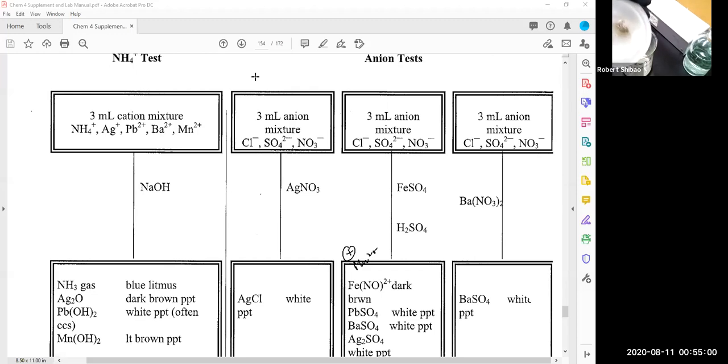Okay, so the crystals turn black. Do you see that? I didn't hit all of them, but I'm sure if I spray those top ones with some sodium hydroxide, they'll turn black too. There we go. Okay, so unknown A came out positive for silver ions.